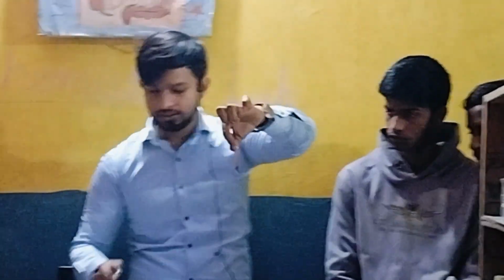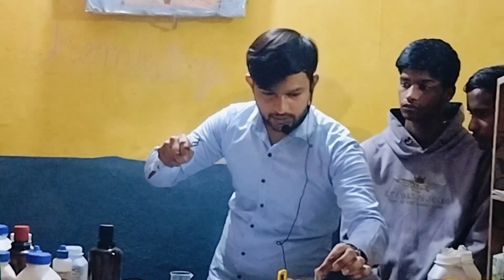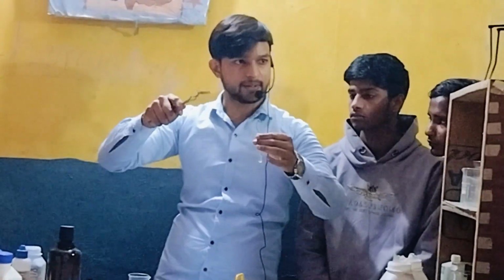Yeah. Now with the help of same litmus paper, we will do another thing. Let me hold it. Okay. Now if I dip into acid, then I think no color will change. Okay.